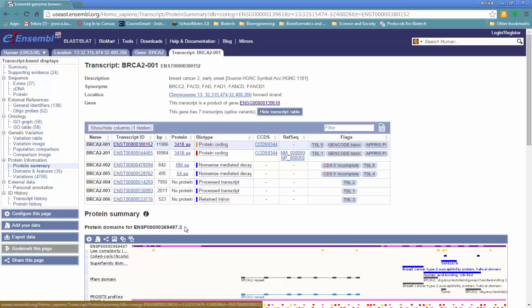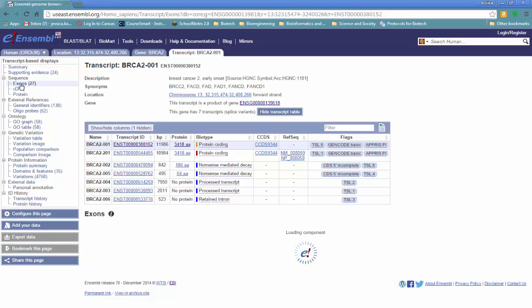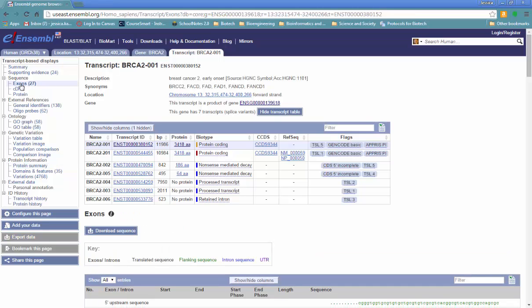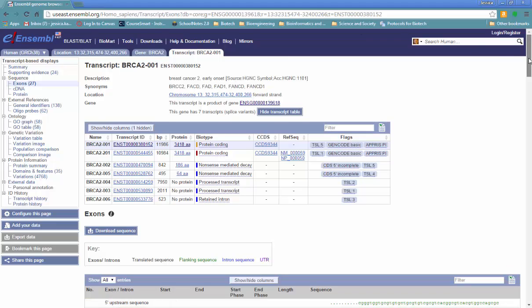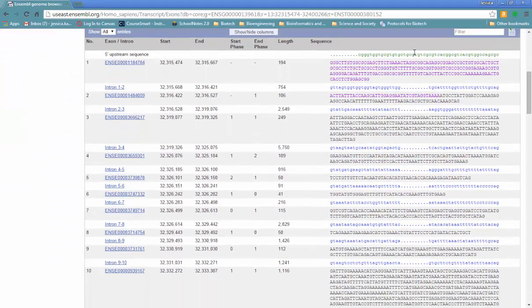All of the information that's available on NCBI is also available on Ensembl, but one thing that's nice about Ensembl is a lot of it is easier to view visually. So for example, we can look at this very large gene that has 27 exons. We can look at the exon intron structure. We can actually see which bases are in which parts of the gene.